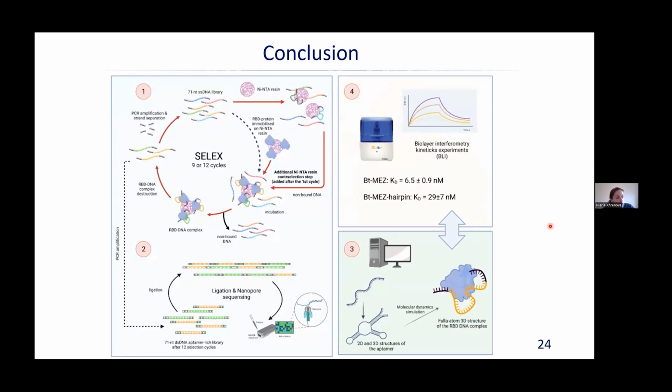So, I'm moving to conclusions. I demonstrated to you how to utilize nanopore sequencing in quite new applications, the search of aptamer structure. And it's a really long story and of course a huge experimental work, and molecular modeling indeed shed light on the molecular mechanism of interactions and helped to understand the nanopore experiments as well as data on binding constant.